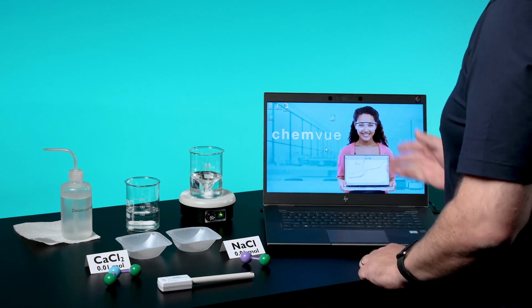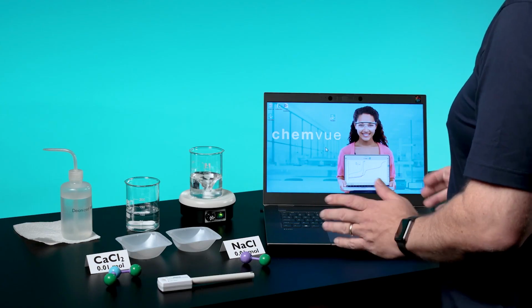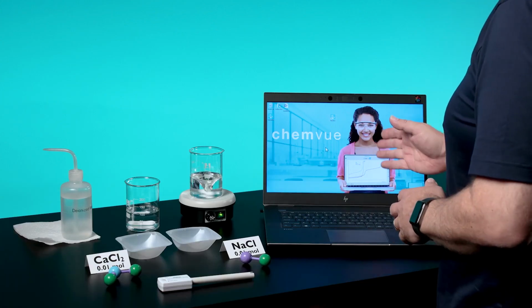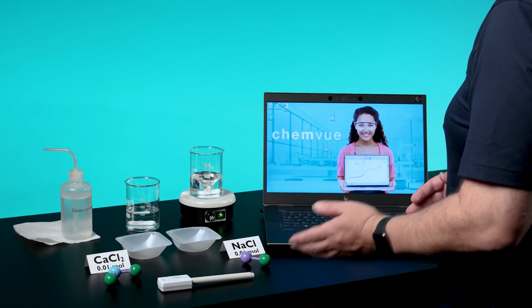Welcome to this introduction to Chemvue software, Pasco's dedicated application for students in the college chemistry lab. In this video, I'll demonstrate the key features of Chemvue for general data collection and analysis with Pasco sensors.